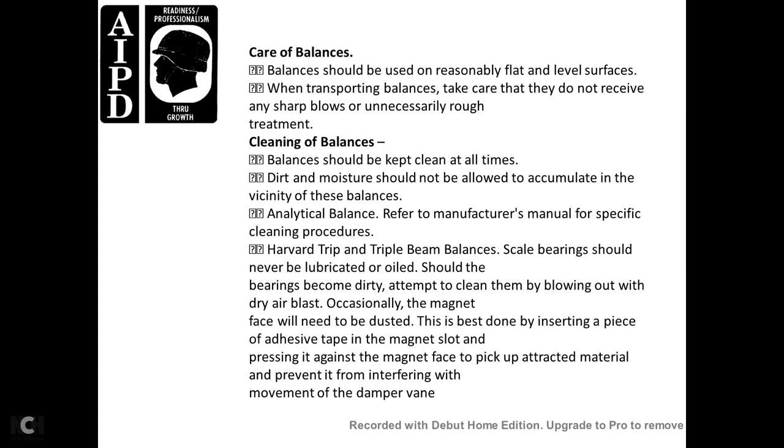Care of the balance. Balances should be kept on reasonably flat and level surfaces when transported. Take care that they do not receive any sharp blows or unnecessary rough treatment. The balances should be kept clean at all times, and moisture should not be allowed to accumulate in the vicinity of the balance. For analytical balances, refer to the manufacturer's manual for specific cleaning procedures.